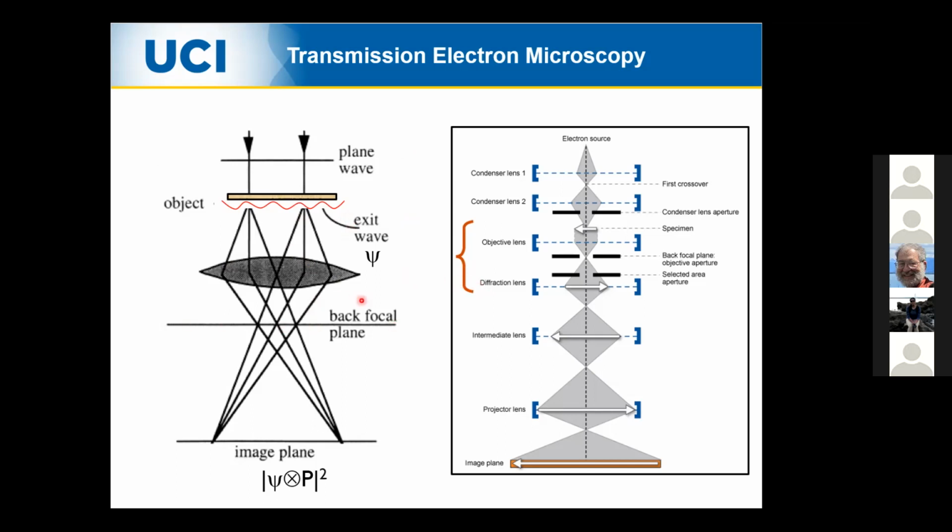And then in the real microscope, we have a series of those lenses that translate the images and finally put them on, for example, a scintillator, and then later it can be digitized into an image, right? So this is how atomic scale information gets magnified and finally becomes an image that you can see.